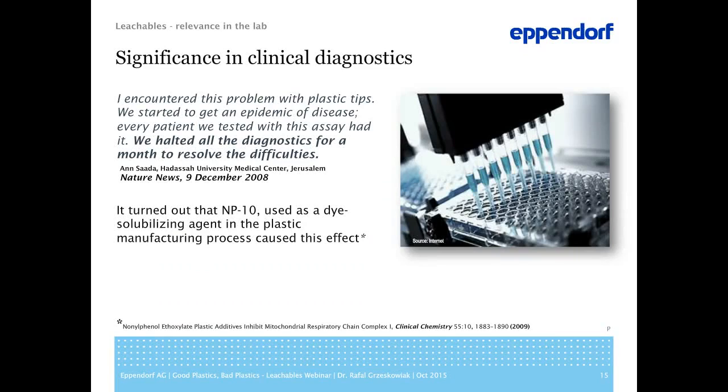We see here significance in clinical diagnostics. And as you might imagine, when assays go wrong in research, well, it's pretty annoying. But if this happens in diagnostics, well, it gains a completely new dimension of significance. It might mean the difference between health and disease, sometimes the difference between life and death.